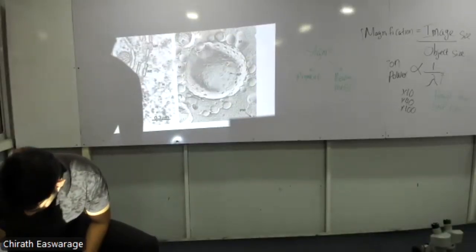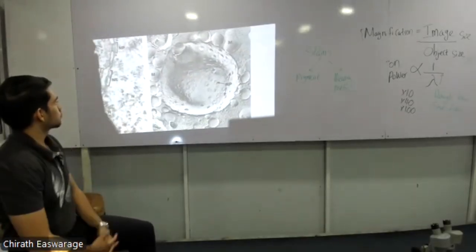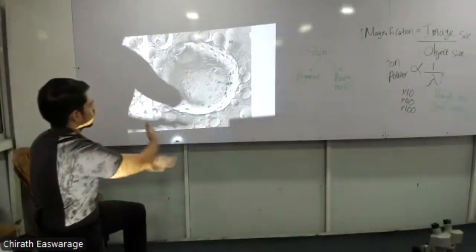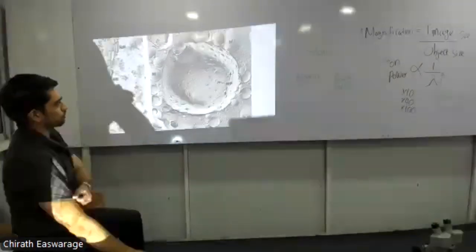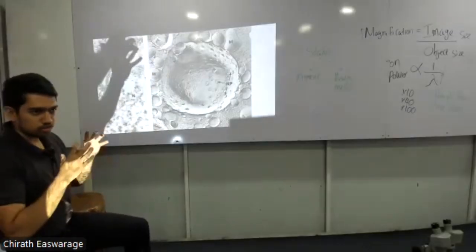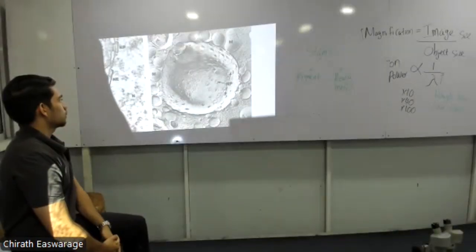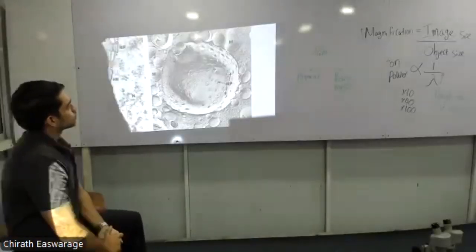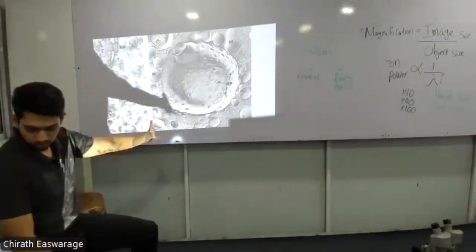Can you see this diagram? It's like the surface of the moon, right? It's not a cavity, but it's a sort of, let's say, an elevated round shape, right? That is inside your cells. What do you have? There's a nucleus, right? Surrounding the nucleus, we have a separate sort of covering for that nucleus that is called the nuclear envelope. Next week we are starting. Okay. So what are we seeing? This is a surface view of that nuclear envelope.